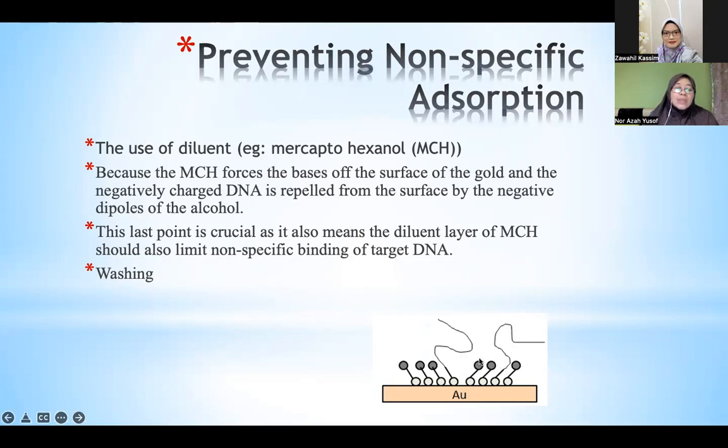That's why when we study DNA biosensors, the response time means that the incubation will take some time and a bit of temperature. We need to increase the temperature to 30, and then incubate for 40 minutes, because it requires time for the extracted DNA to come here because of the passivation as well. What next we can do is washing. After incubation with the extracted sample, we expect the target DNA will hybridize with the probe DNA, and we also expect other proteins that interfere.